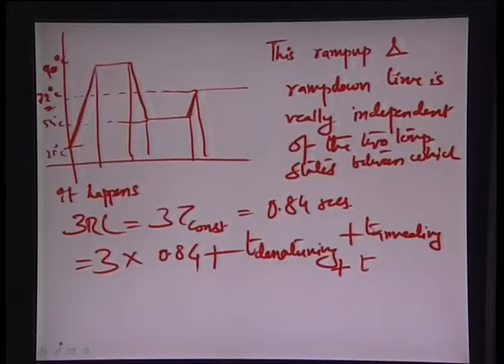So really if you can have a control on the ramp up and ramp down of the material that is involved in the heating process, like for example the remaining portion of the chip over which probably the heaters are placed, then controlling from the surface which is in close proximity to the solution is really independent of the 2 temperature states. This is a very important concept to be understood at this stage.